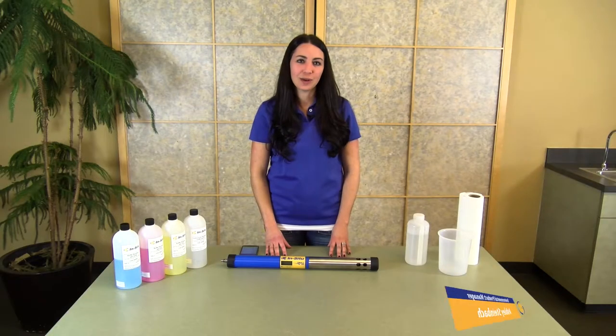Hi, I'm Ashley Steinbach, the environmental product manager here at InSitu. Today I want to show you how to calibrate the AquaTroll 600.